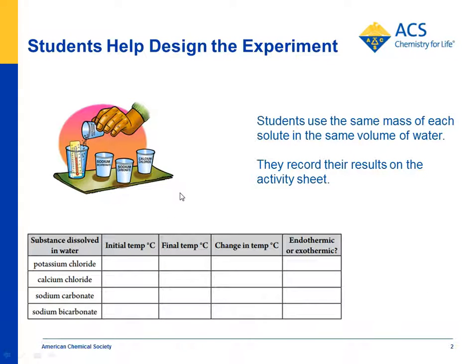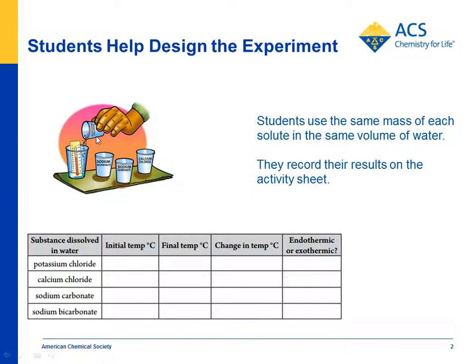Students have four different substances to dissolve and check the temperature: potassium chloride, calcium chloride, sodium carbonate, and sodium bicarbonate. They use the same mass of each one in the same amount of water. First they put water in a cup, check the initial temperature, add the substance — in this case potassium chloride — check the final temperature, then write the change in temperature and whether it was exothermic or endothermic.